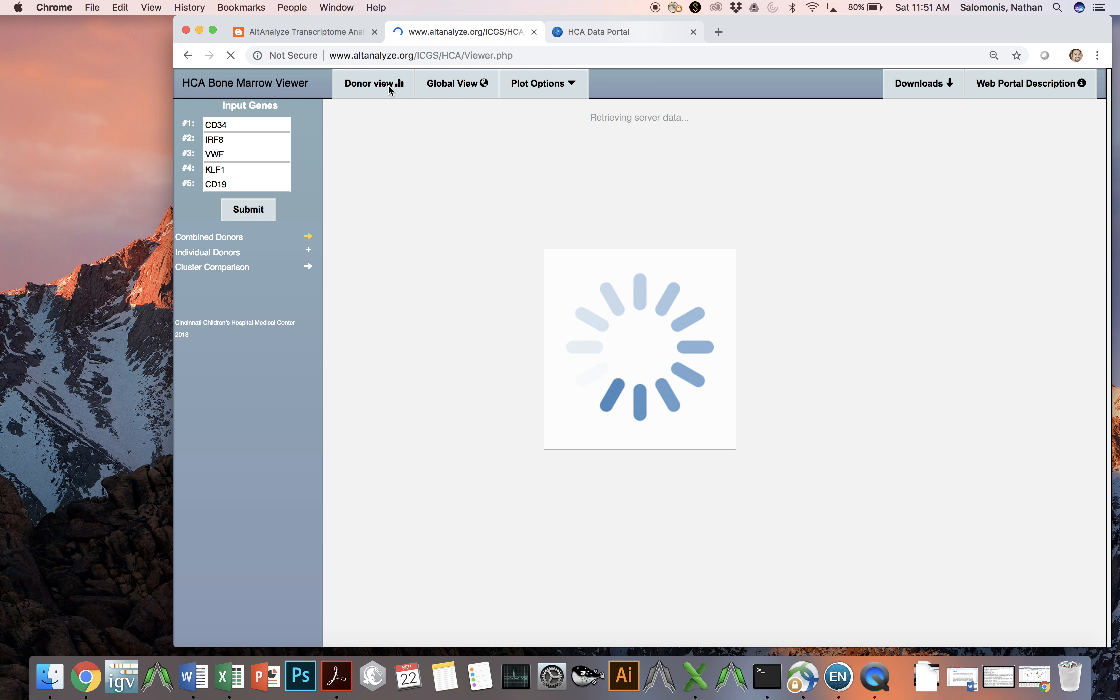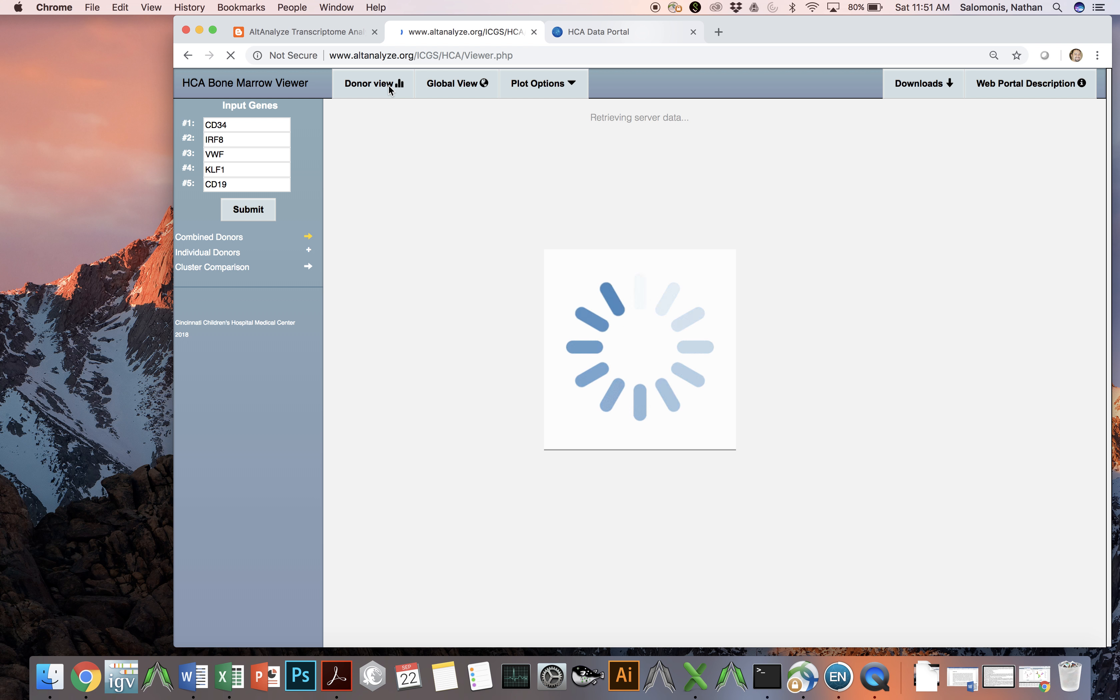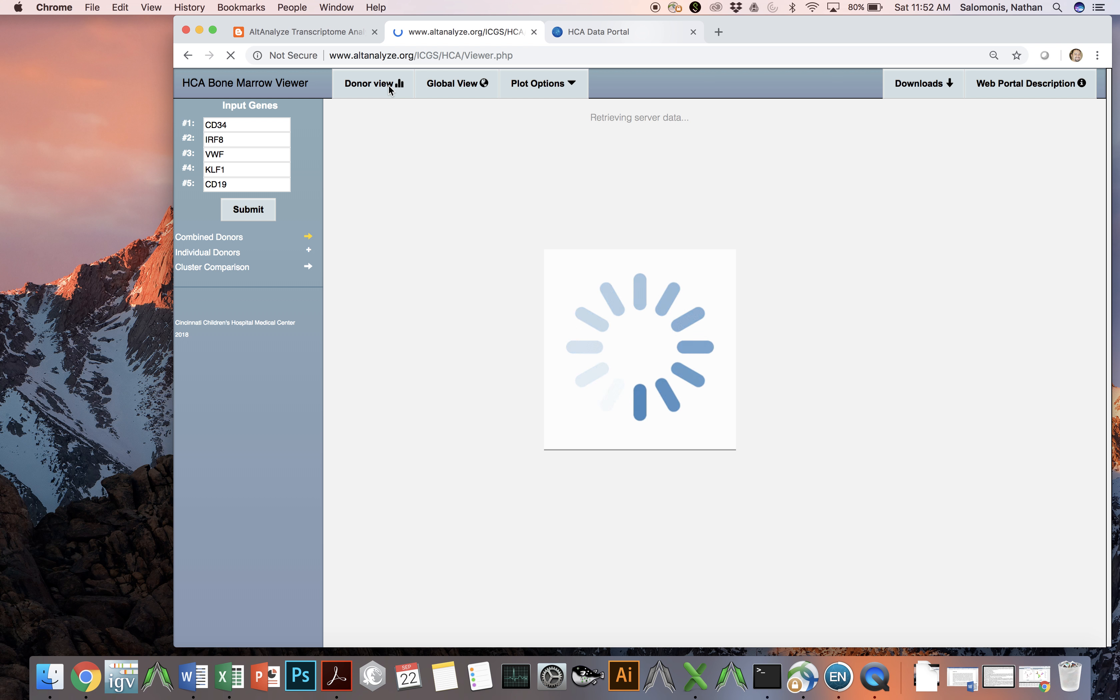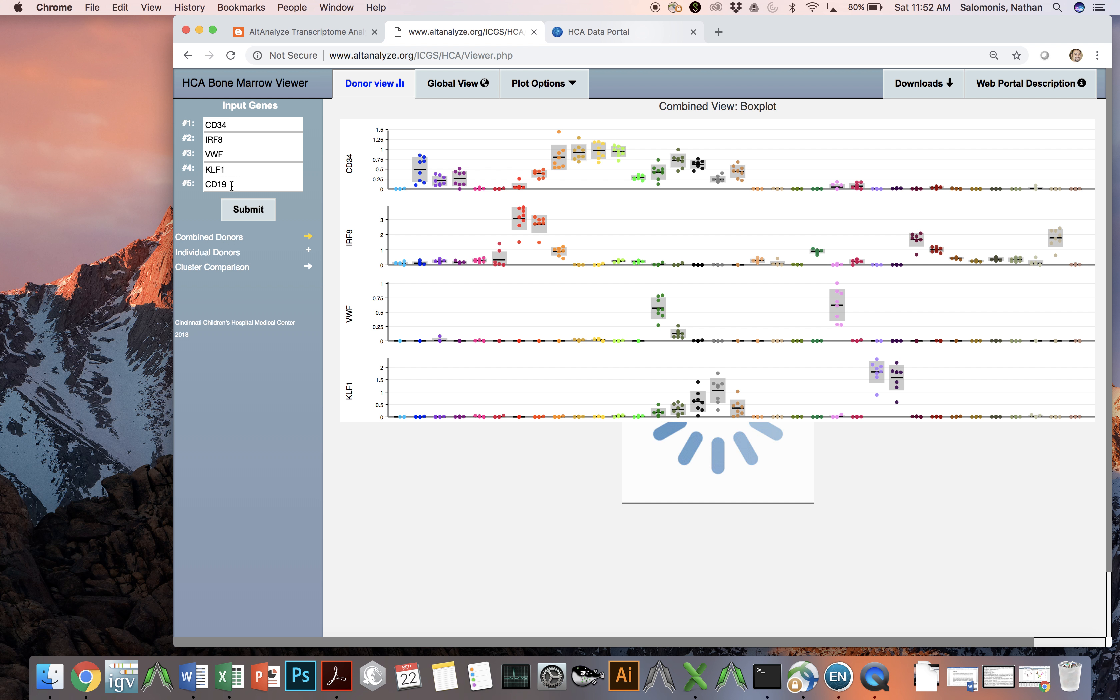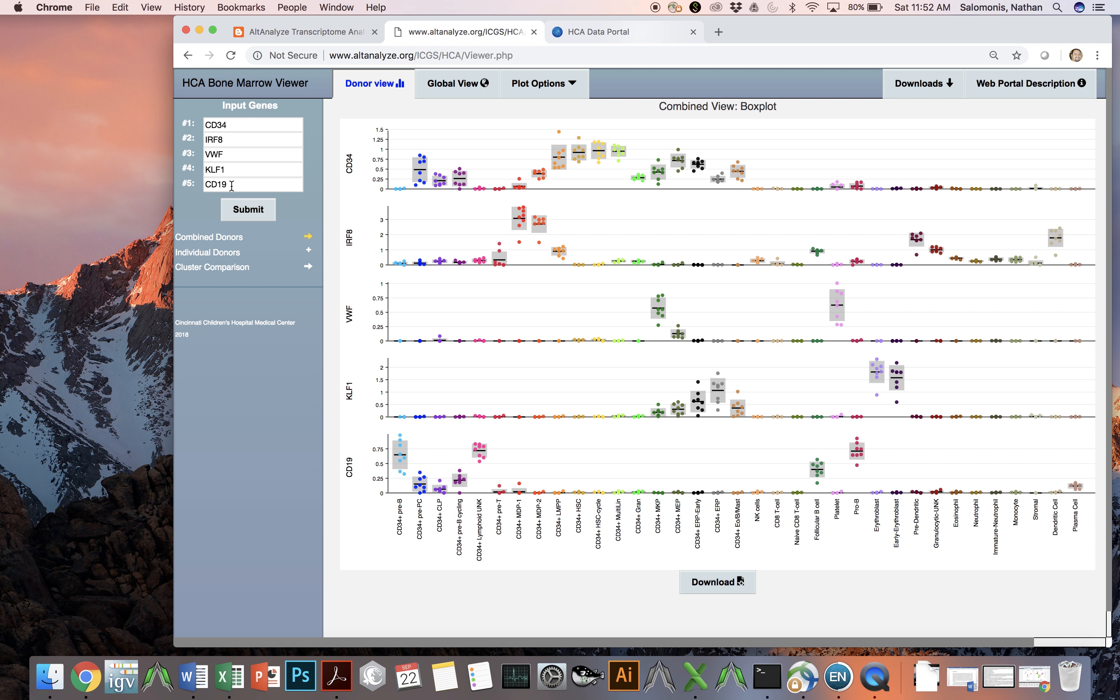You can also look at what's called the donor view, and the donor view contains the same data but now actually spanning all 35 distinct specified and progenitor cell populations. On the left are a set of default genes that are shown, which are going to display in various plots, either in the combined donor view, which is what we're looking at now, or the individual donor view.